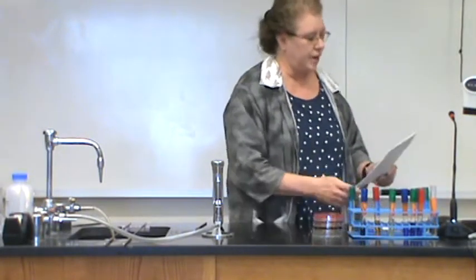If you look at your handout, the first thing you would do is a gram stain. Very important, this is always the first step, because this is concrete for one thing, and it gives you some very valuable information that can narrow your choices down drastically. First of all, morphology doesn't change.